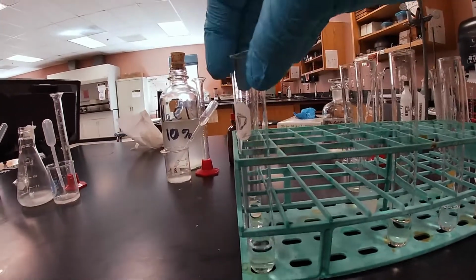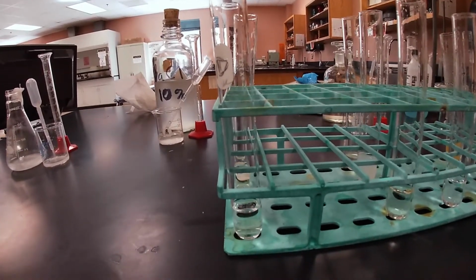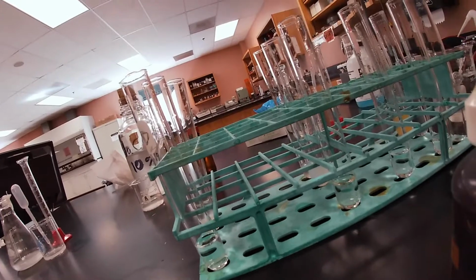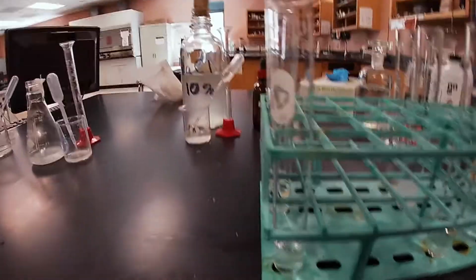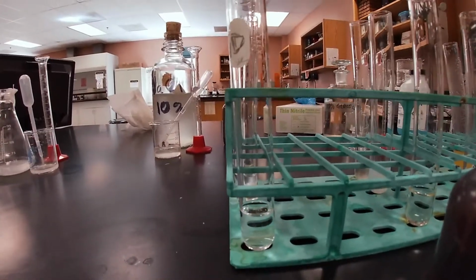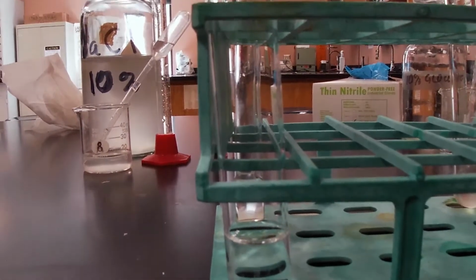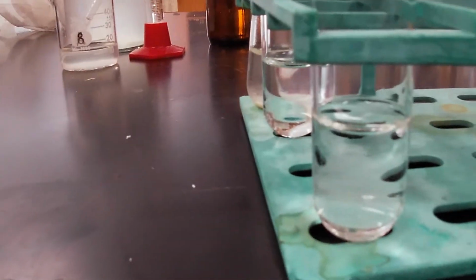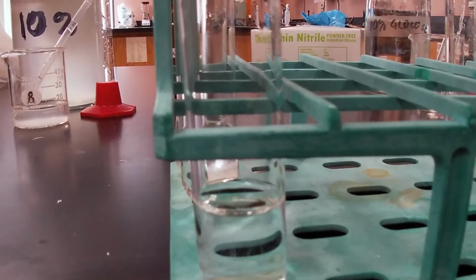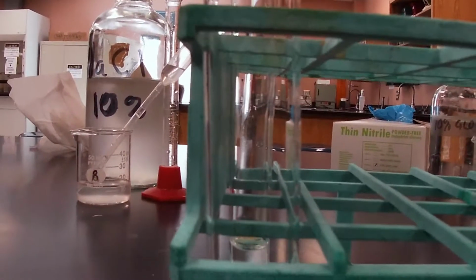and make our iodine test. Let me go ahead and zoom in on this one. It's not allowing me. Give me a second. I'm gonna get some iodine. Let me zoom it in for you. Okay, as I add it, no color change. I'll add a few more drops so that hopefully you can see. There is no change whatsoever. So, no starch present.